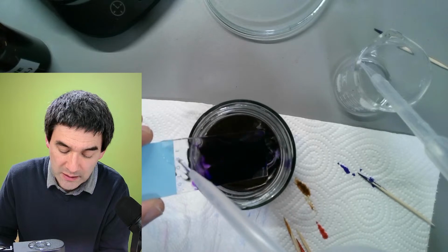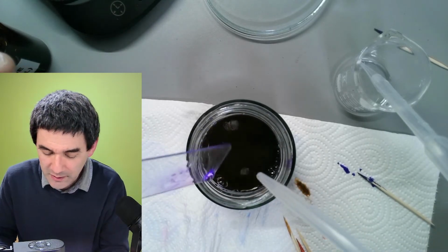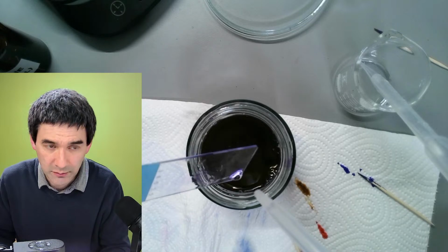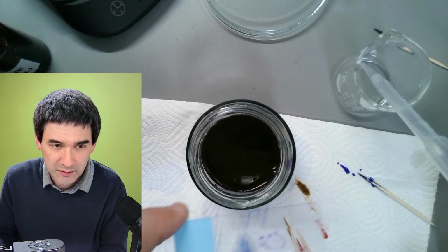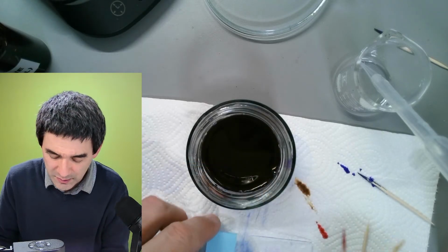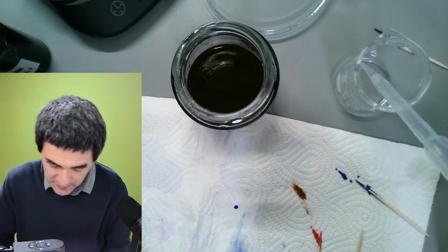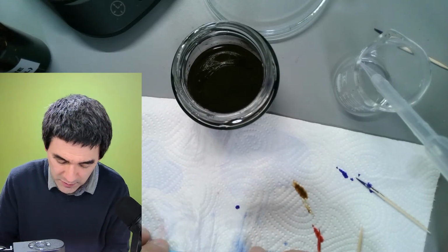So we're gonna do it again. You already know this. Okay. And here we go. Yep, and you see that it's stained blue. I'm going to quickly dry it a little bit, just to remove the excess. And let's have a quick look under the microscope again.